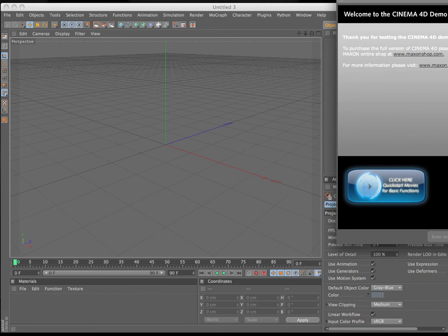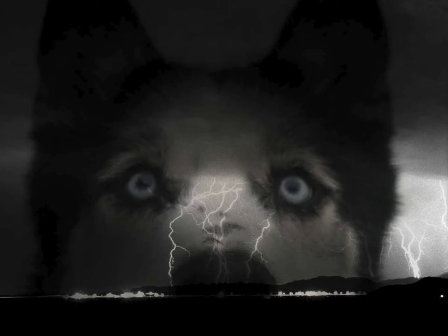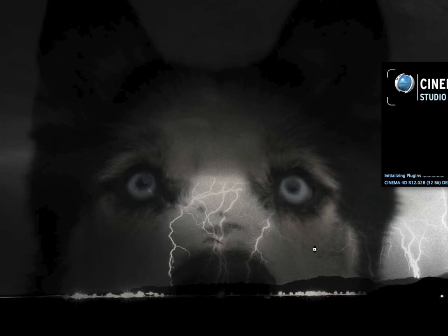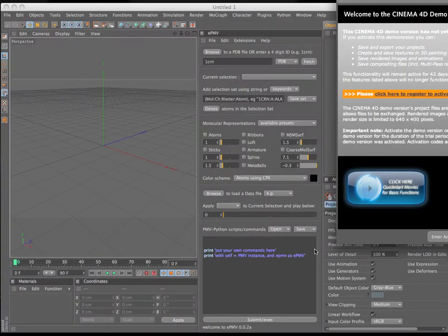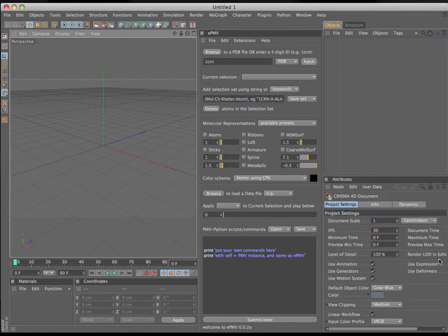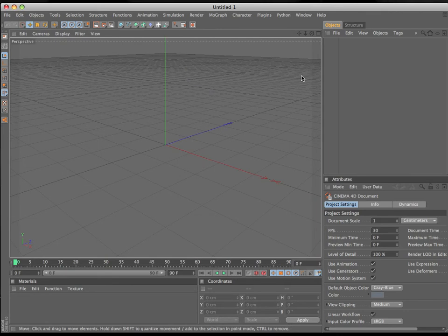Hi, it's Graham Johnson again with Ludovic and Michel in Ardelsen's Molecular Graphics Lab at the Scripps Research Institute. I'm going to step through some of the very basic functions of the Embedded Python Molecular Viewer to help get you up and running as quickly as possible.